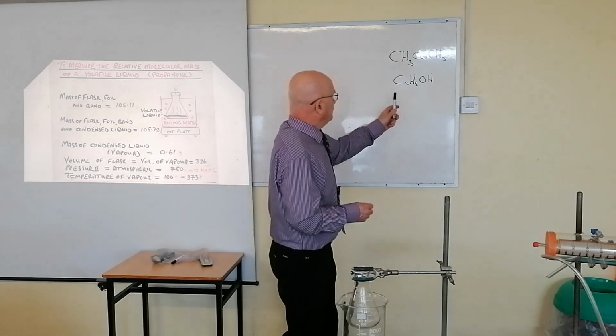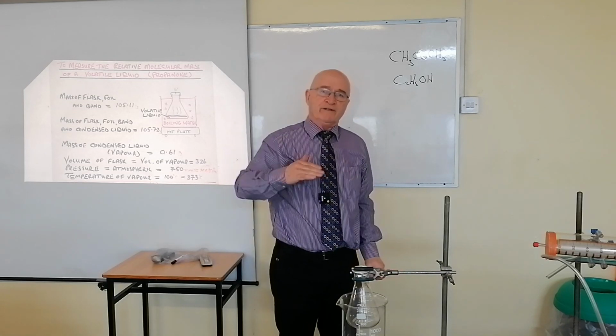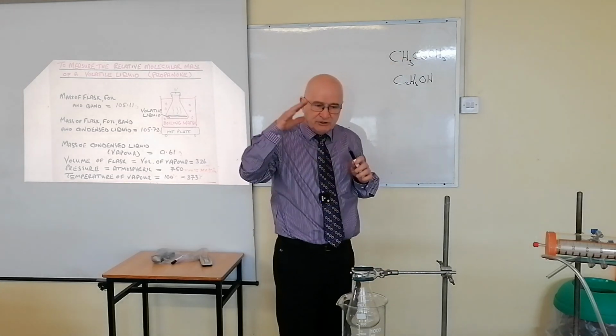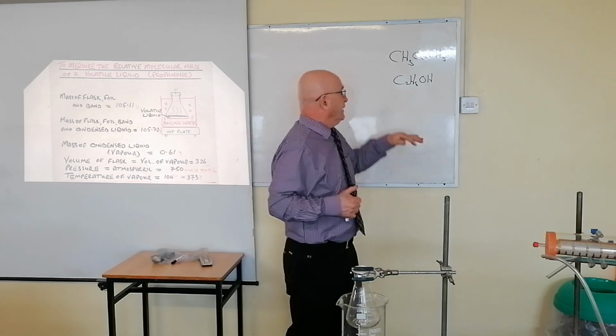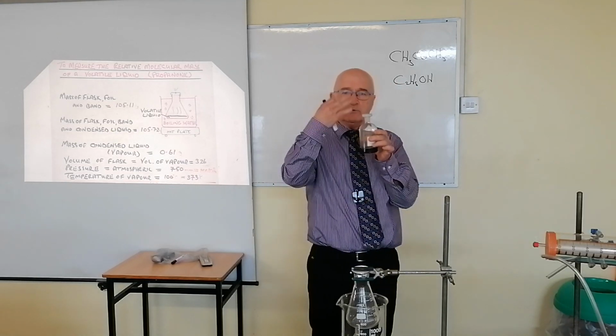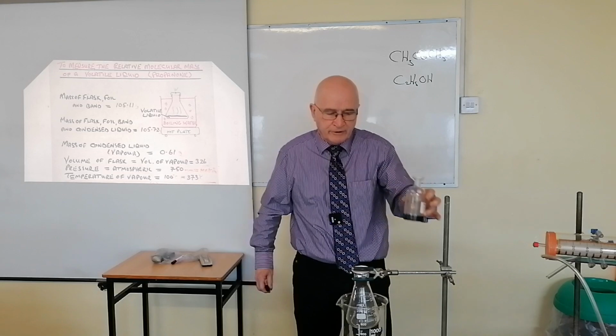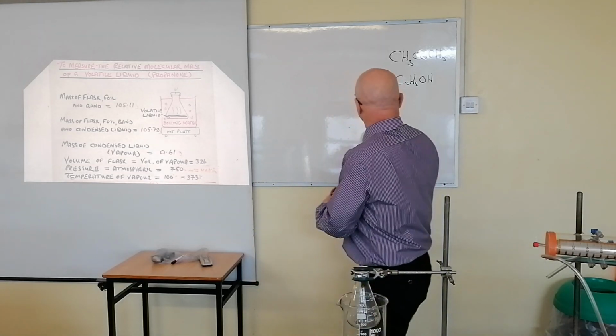But you can imagine if you're trying to vaporize that, you'll have to heat the hell out of it because its boiling point is higher. If something has a lower boiling point, generally speaking, you'll find it will volatilize or vaporize very easily. If I take the lid off that, you'll get quite a waft, you'll get a vapor from it straight away. Volatile liquids vaporize very easily, and that would be rather important that you do that, okay?